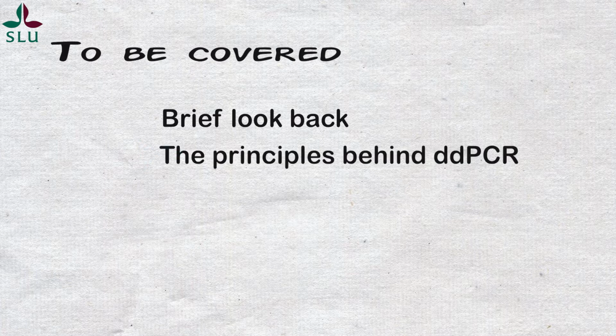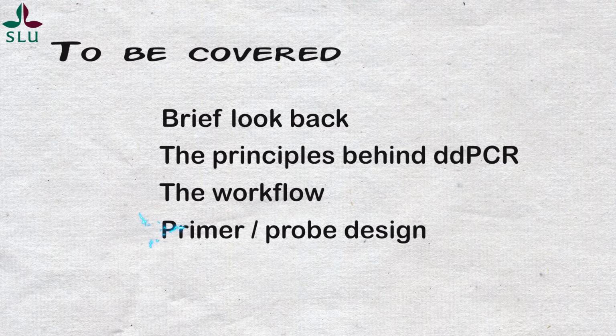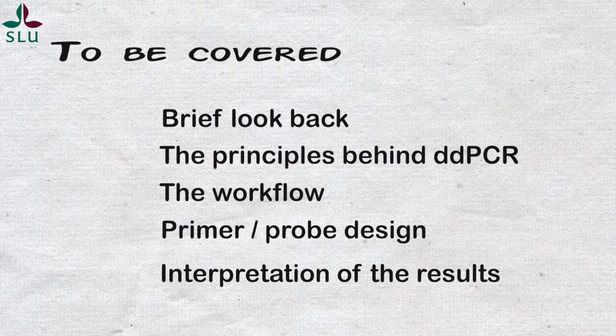In the presentation, I will first provide a general look back at the topic of molecular identification of GIN genera using PCR technologies. Then I will move on and give an overview of the principles behind droplet digital PCR technology and how it works, after which some of the advantages of the method compared to similar technologies will be discussed. This will then be followed by a brief presentation on the workflow used in ddPCR. And finally, I will go into how to proceed in terms of primer probe design and in the analysis of the data generated.